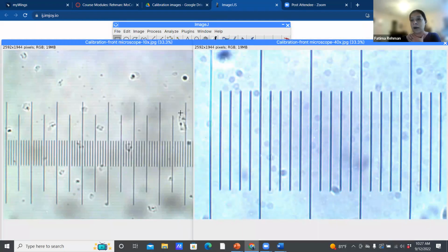Now, because these images are taken using the same stage micrometer, we know how many micrometers the distance between two tick marks is. And what is it? Everyone should already know that information. So what is the physical length between two tick marks? No, it is not 5, but remember the conversion factor, 10 micrometer per stage unit? It's still the same, 10 micrometer per stage unit, but you're just converting pixels into micrometers.